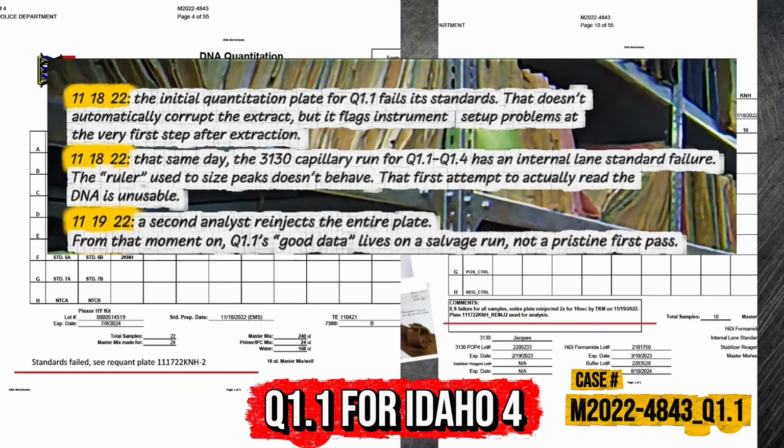That same day, the 3130 capillary run for Q1.1 through Q1.4 has an internal lane standard failure. The ruler used to size peaks doesn't behave. The first attempt to actually read the DNA is unusable. 11/19/22, a second analyst re-injects the entire plate. From that moment on, Q1.1's good data lives on a salvage run, not a pristine first pass.